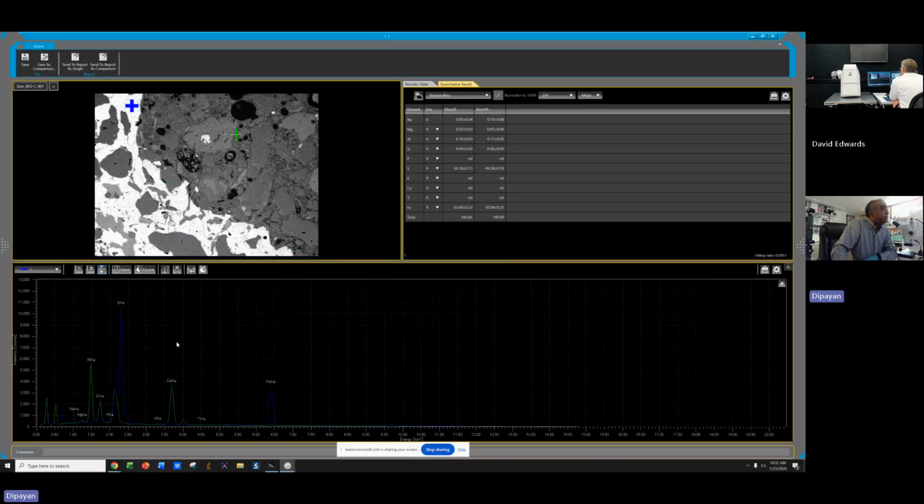No, what was happening before, Dave, if I don't physically press this button, when I create my report, I don't see the quantitative result. Oh, okay, shrink this window.